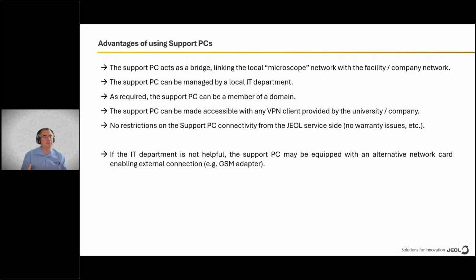For example, people who are interested in single particle analysis or electron tomography will normally have access to a computational resource, either a cluster or a powerful workstation that allow them to process data.